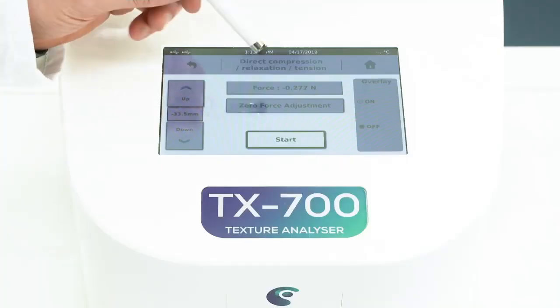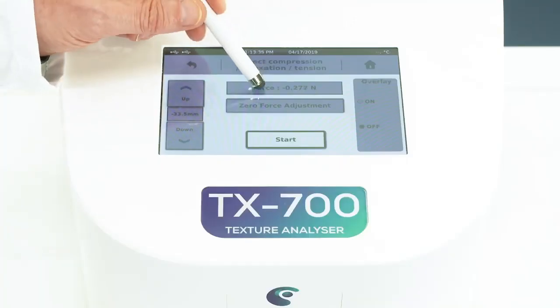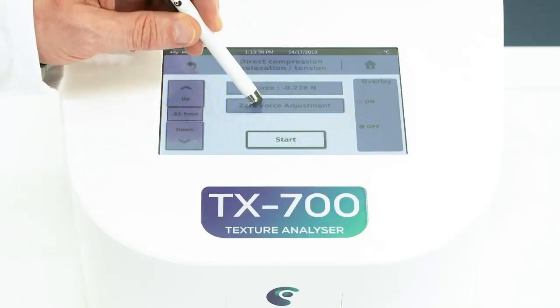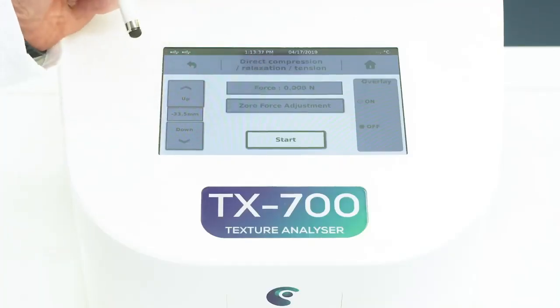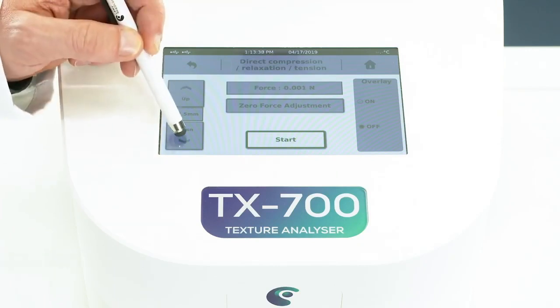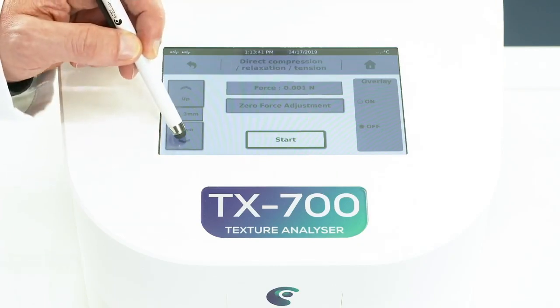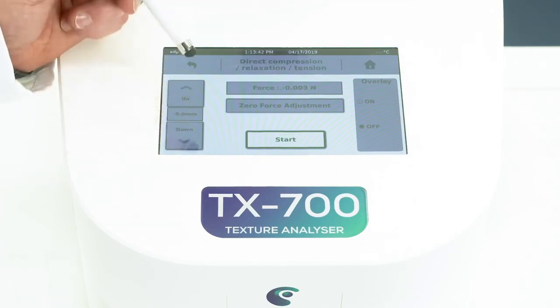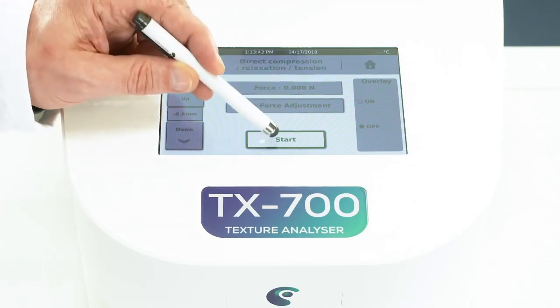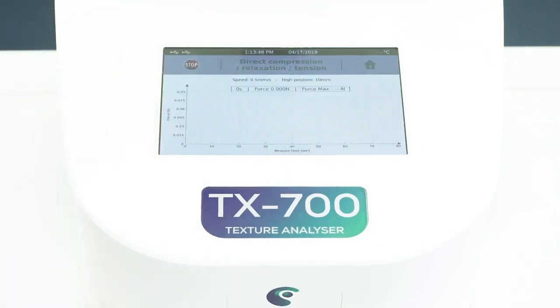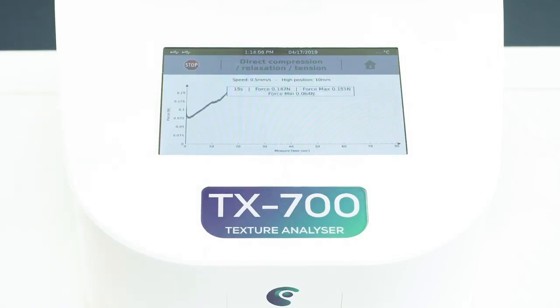Zero your force sensor and start your measurement. The TX700 shows you directly the curve on screen while testing.